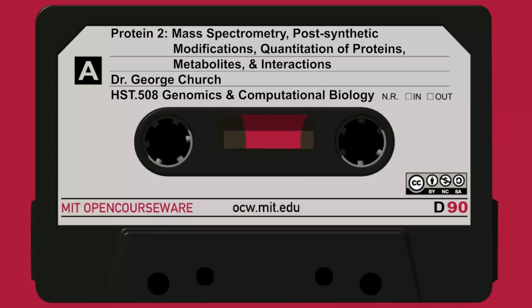Okay. So now we've calculated the reverse phase behavior here on the far left-hand side of slide 17, and this is separated by hydrophobicity. And then we have mass, which we've outlined how you can calculate. So now you can calculate both its hydrophobicity on the vertical axis and the mass on the horizontal, and you can make this two-dimensional plot in the computer. In this case, this is actually observed data, but you could also superimpose the calculated ones. These are slightly streakier in the reverse phase retention time, RT, just because of the scale that one uses or the properties of the separation method.